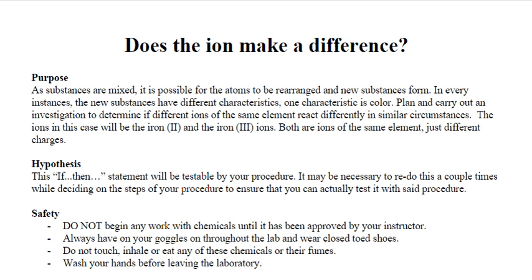Also, wear closed-toed shoes. If you don't have closed-toed shoes, I'm not going to allow you to do the lab. I will not even let you make it up. I'm just going to give you a 0. Make sure you bring closed-toed shoes. The reason why is some of the chemicals that we're going to be talking about will burn your little piggies down there and you won't be happy. You'll probably be in some pain. So make sure we bring closed-toed shoes. If that means you have to just bring them with you and wear them for this period, that wouldn't be the first time that's happened. So make sure you bring closed-toed shoes.